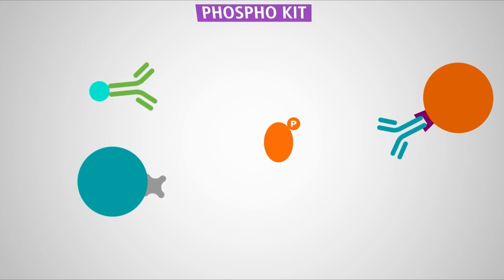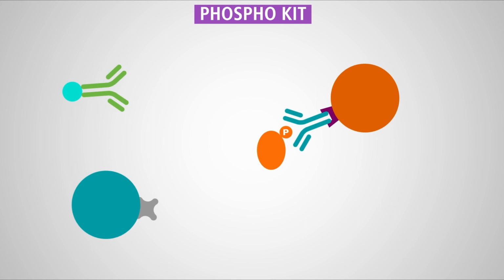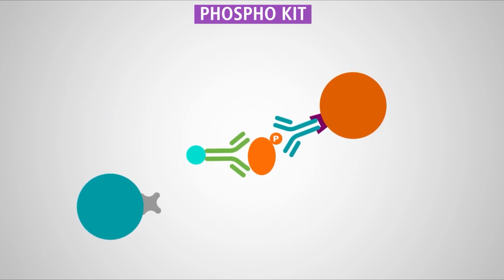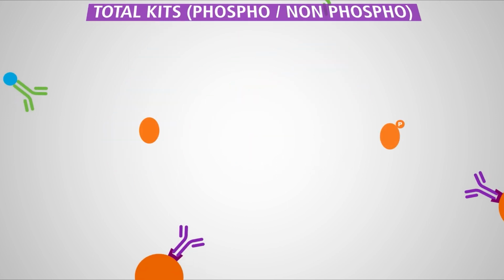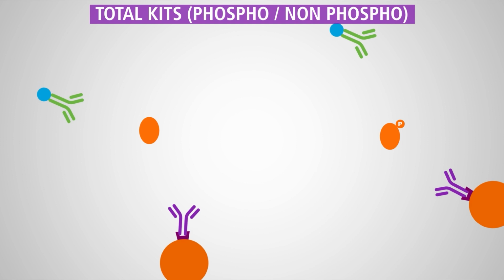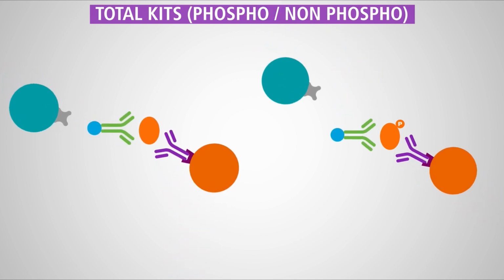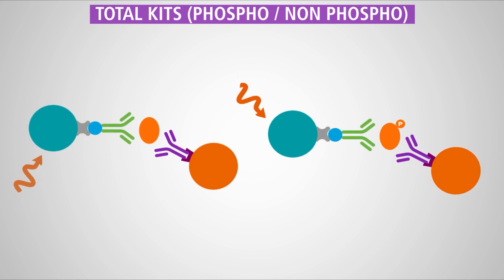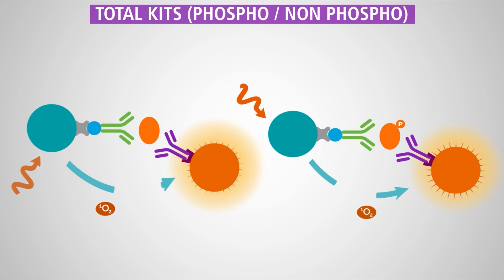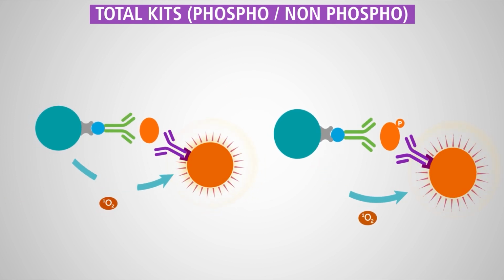In the phospho kits, one of the antibodies is specific to a phosphorylated epitope on the protein and the other antibody recognizes the target protein at a different location. In the total kits, both antibodies recognize the target protein independently of its phosphorylation status. In the presence of the targeted phosphorylated or total protein, the two antibodies bring the donor and acceptor beads in close proximity, allowing the alpha signal to happen.